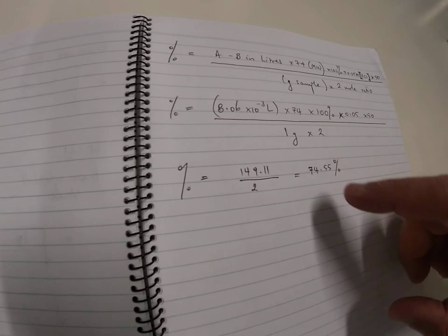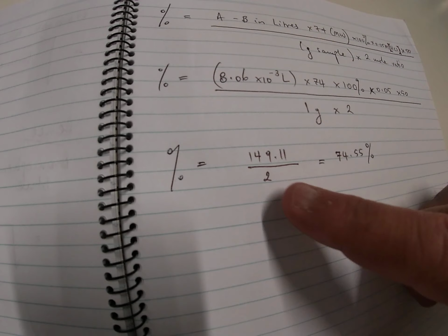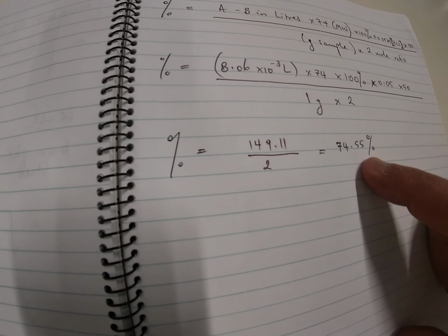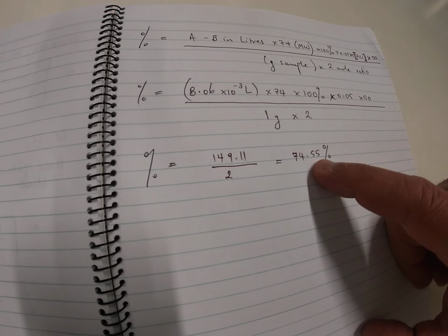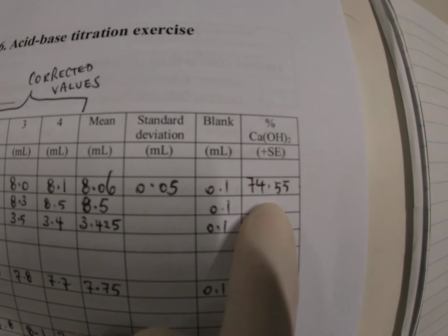Once you work out the answer, the first part of this equation works out to 149.11. Divide that by 2, so the overall percentage of calcium hydroxide in solution number 1 is 74.55%. And here it is. That's it. Thank you, Bob. Thank you, Barry.